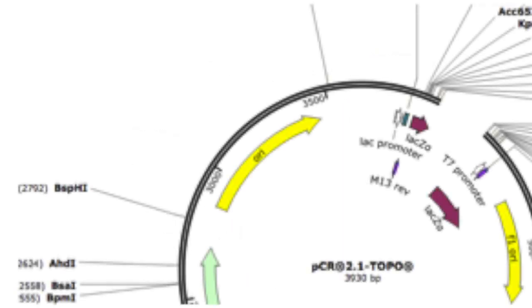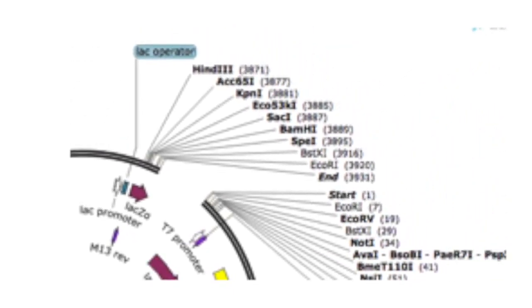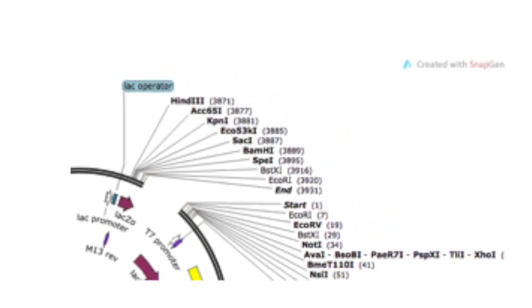Replication origin: specifically, the vector TOPO TA cloning kit PCR 2.1 TOPO consists of 11 GATC regions in a 254 bp fragment. This origin of replication is known as pUC. Resistance genes: E. coli acquires resistance to selective media, kanamycin and ampicillin, and can grow smoothly. Multiple cloning site: it has unique targets for specific restriction enzymes and allows the introduction of new cDNA fragments.